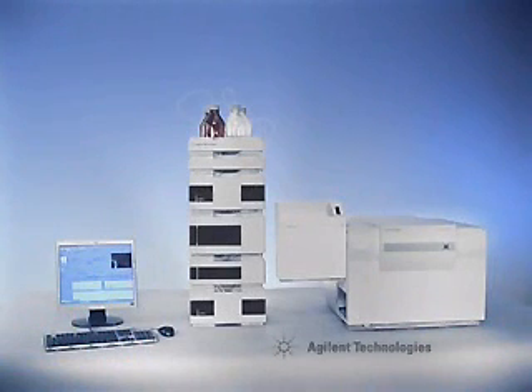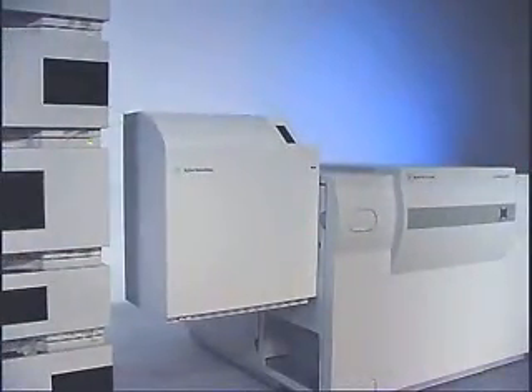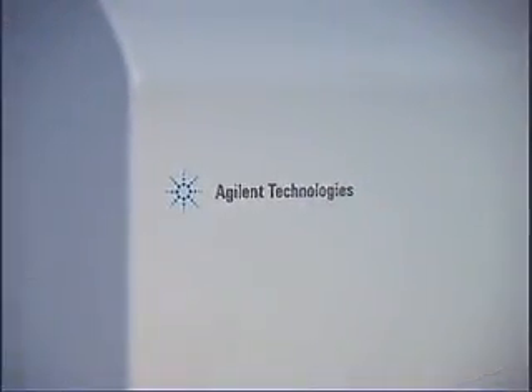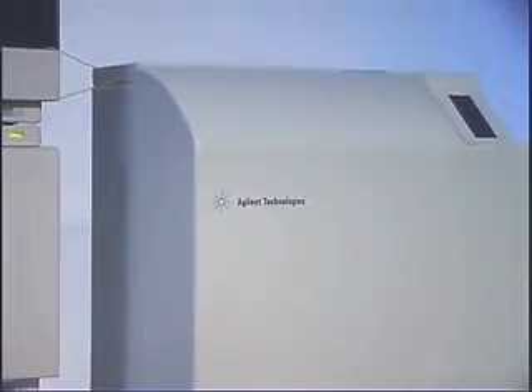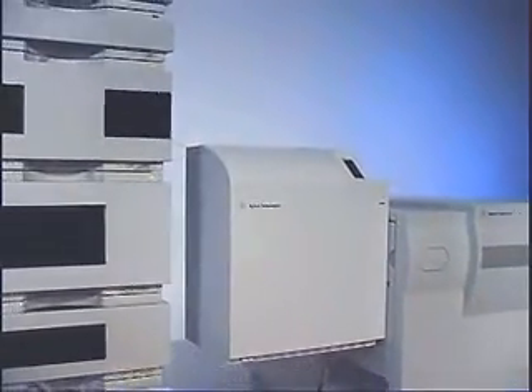It's time to prepare for a new generation of LC-MS technology from Agilent. The Agilent HPLC Chip-MS platform takes you to a new level of NanoFlow LC-MS performance by combining microfluidics with an easy-to-use plug-and-play interface that lets you focus on your results. The HPLC Chip-MS platform is based on the new Agilent HPLC Chip and Agilent HPLC Chip Cube-MS interface, designed for use with the Agilent IonTrap and time-of-flight mass spectrometers.